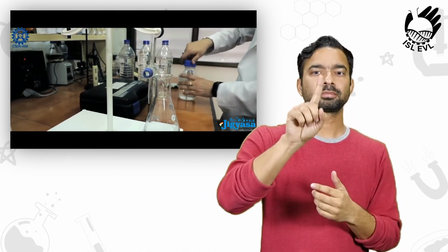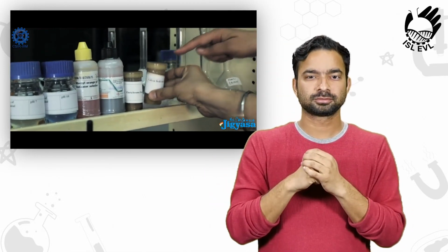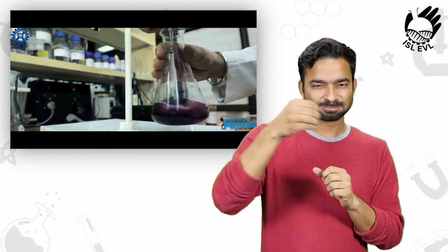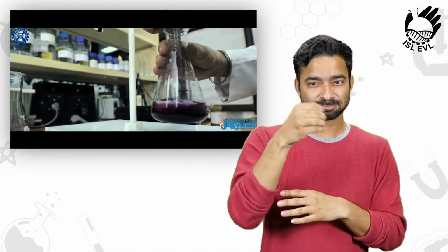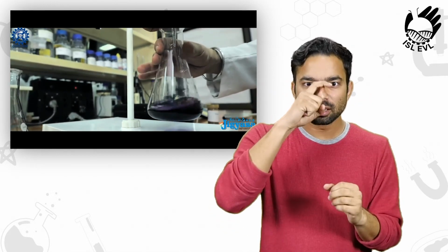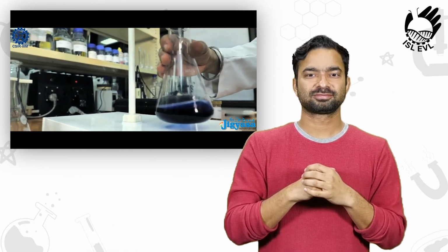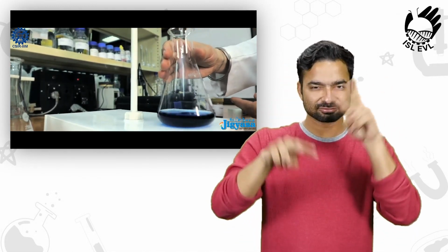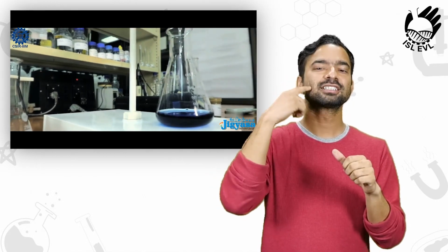Then the indicator of pH 12, 1 ml. Going to add Calcon indicator. So the color will change from pink to blue. We are doing the titration. We have to closely observe the end point. See, we have achieved the end point. The color changes from pink to blue. Using the calculations, we can find out calcium.